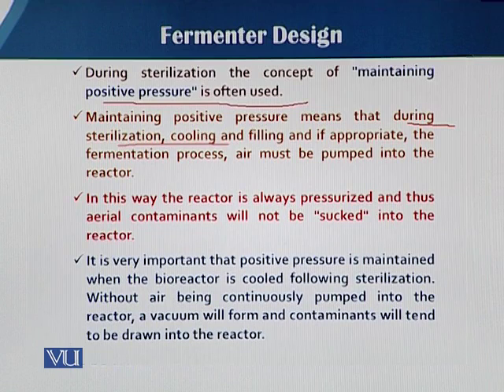So at the time of sterilization, at the time of addition of the inoculum, or when we run a fed batch fermentation, we have to add something inside the fermenter.